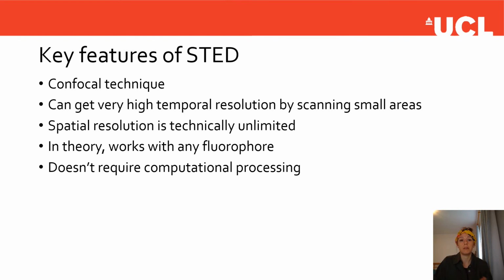The spatial resolution is technically unlimited. So in theory, you can make that hole infinitely small by making your STED beam infinitely intense. And it doesn't require any computational post-processing in the same way that SIM did, for example. So basically, you turn your STED beam on, get your image, and it's already at super resolution.